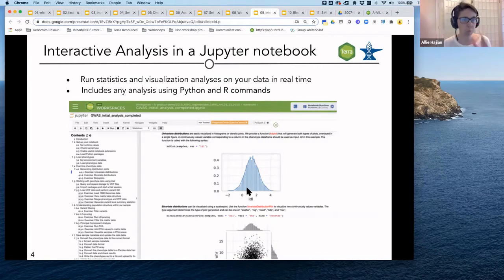Okay, so this is what notebooks look like, and you'll see that in a second. The nice thing about notebooks is they include code and documentation all wrapped up in one package. If you write enough documentation, it makes your work very reproducible and shareable. It's easy to share your notebook with another colleague who can look at it. I think it'll be clearer as we do the demo, and I want to get to that because that's the very satisfying part.